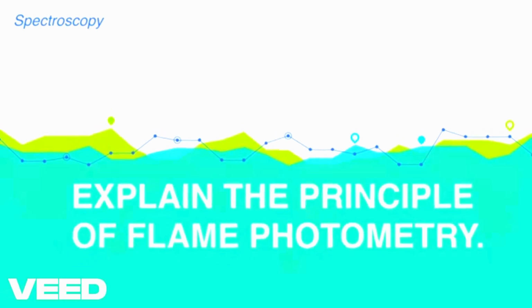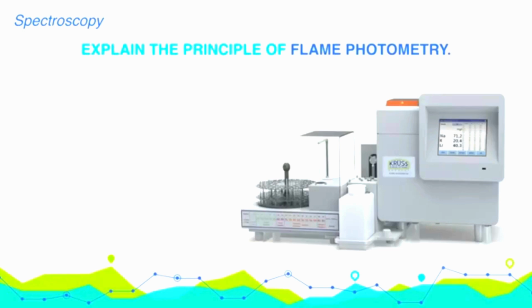Welcome all. Now we are going to explain the principle of flame photometry.